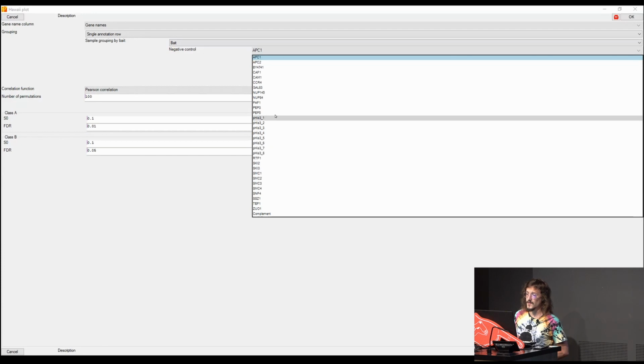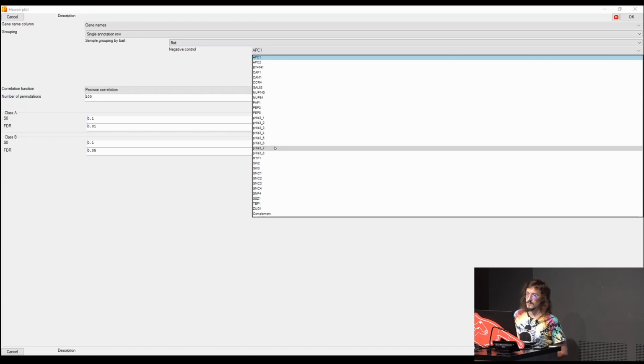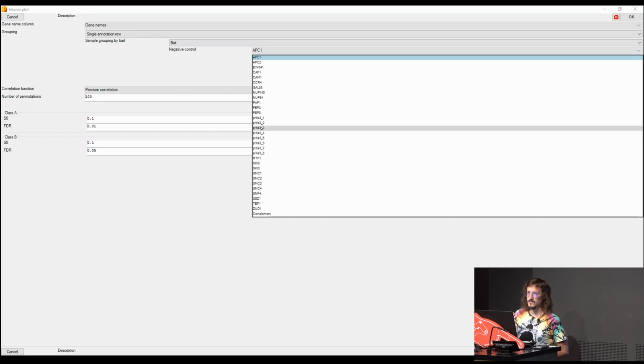One thing that, if you want to try at home, I can recommend you to do, you see, these are all the same control. One thing also to see how the result changes using more controls, more data coming from the unspecific binders.